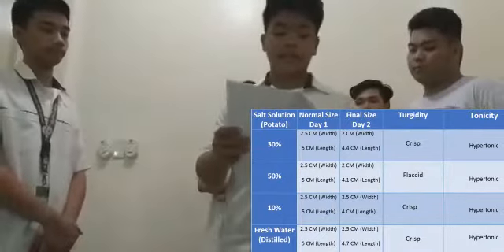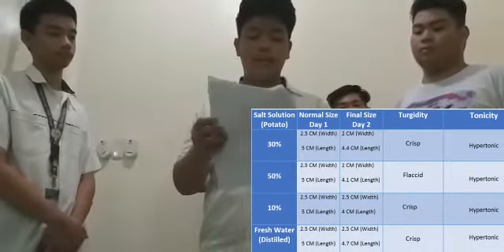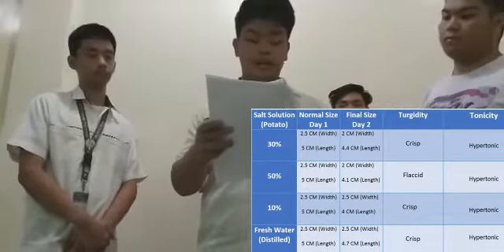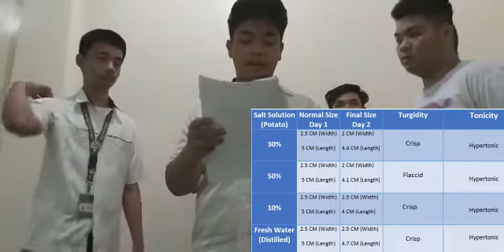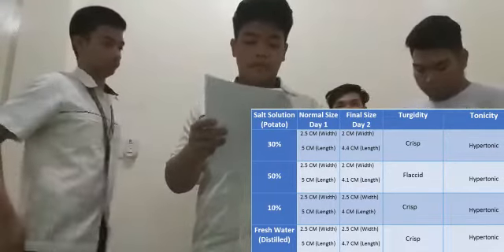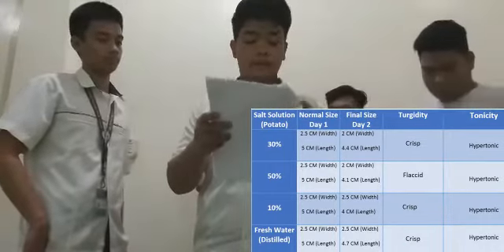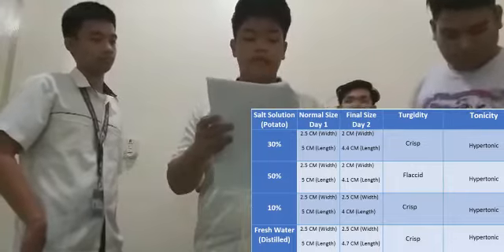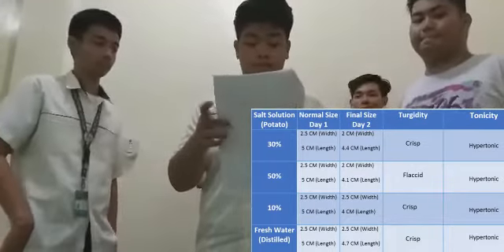I discussed the 10% salt solution. The initial day 1 width is 2.5 centimeters and the length of the potato is 5 centimeters. The final day is 4 centimeters in length and 2.5 centimeters in width. The turgidity is crisp and the tonicity is hypertonic.